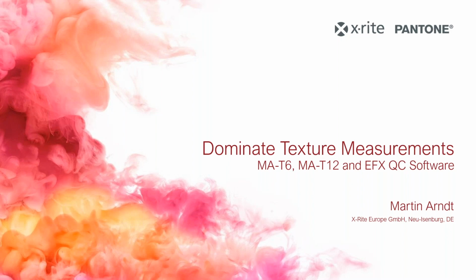Okay, so a warm welcome from my side. Like introduced, I'm Martin Arndt. I'm working as an application specialist for X-Rite Europe, and I'm based in Germany. I would like to welcome you to our seminar, Dominate Texture Measurements, with the MAT6, MAT12, and also with the EFX QC software.